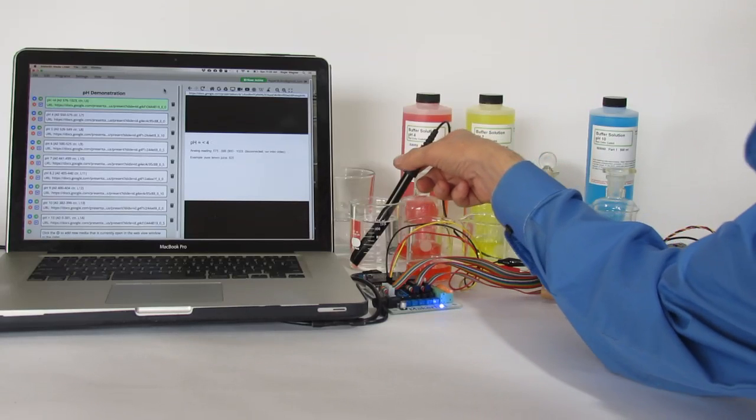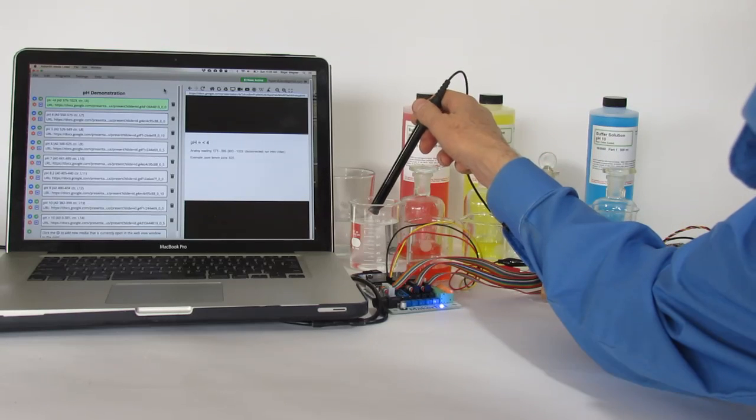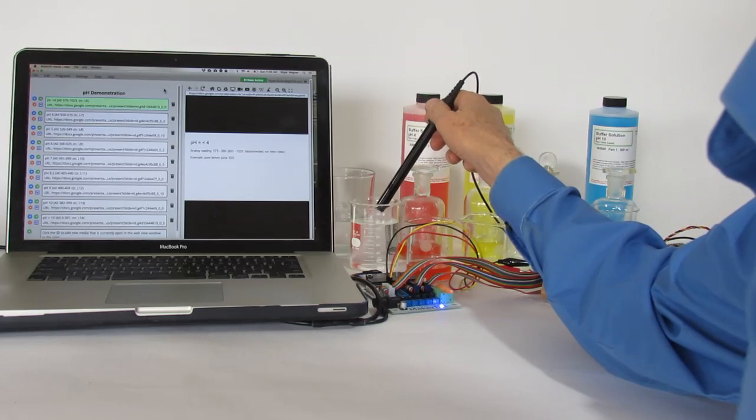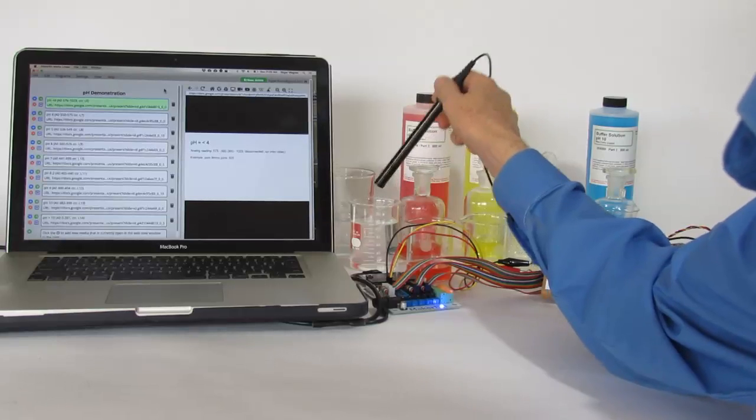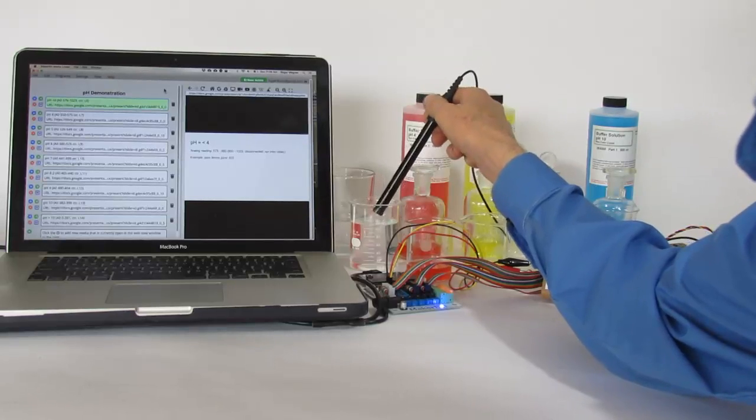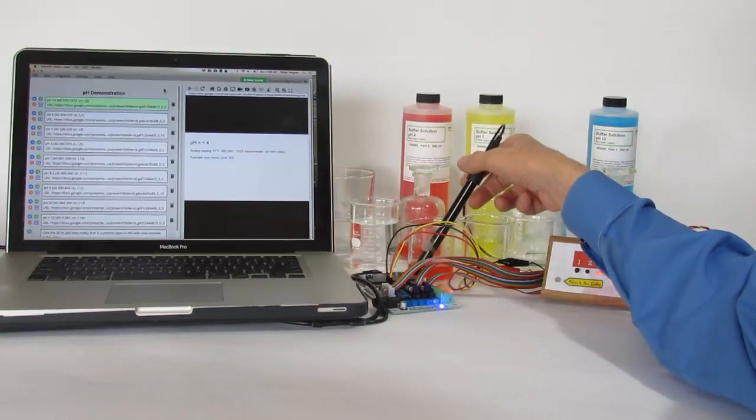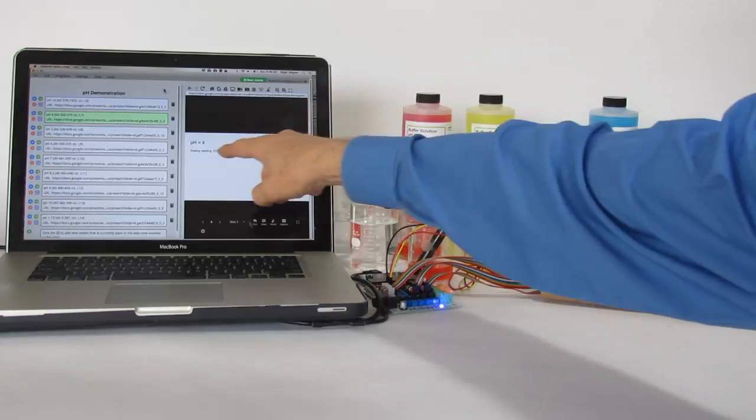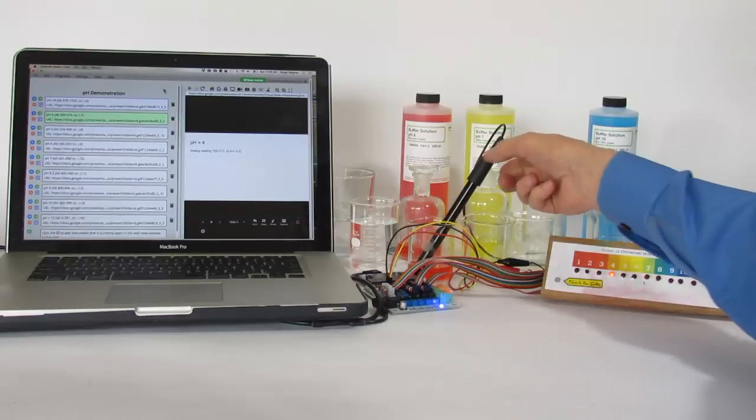This is just a simple demonstration. We'll start right now. It's in a solution with a pH slightly less than 4. We're going to move it to a buffer solution, pH 4, and you'll notice the slide changes.